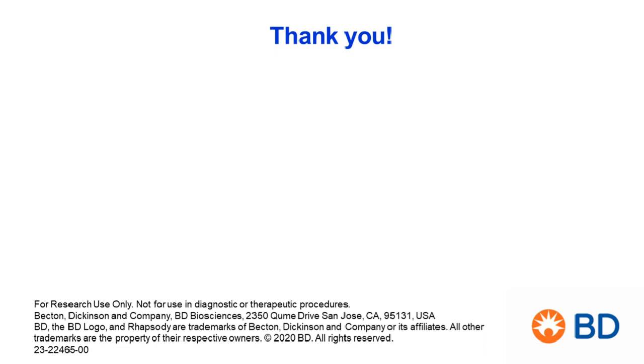So that actually leads into the next question, which is, can you provide comments further about some of the specific bioinformatic methods that were applied to integrate protein and gene expression data and to identify cellular composition? Yes, I hope I conveyed a bit of the message here. As I mentioned at the end of my slides, this is a hot topic. The way we're doing it at the moment, as I demonstrated in the slides, is a simple approach, the simplest thing we could do, which is also recommended by some available packages, such as Seurat: to first analyze the protein composition and then analyze the transcriptomics. In the way we did it, we basically integrated the data by looking at the gene expression patterns that characterize specific subsets of cells that were identified with AbSeq.